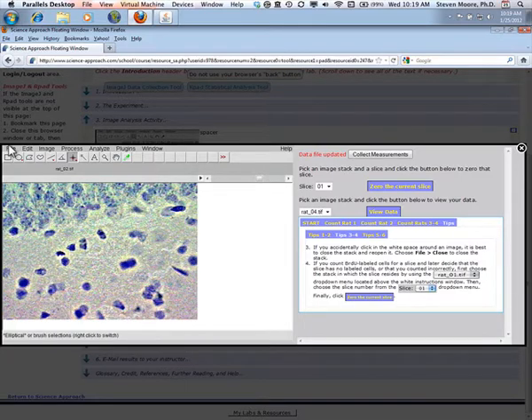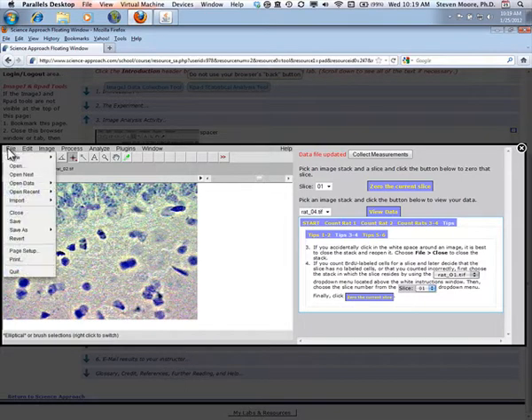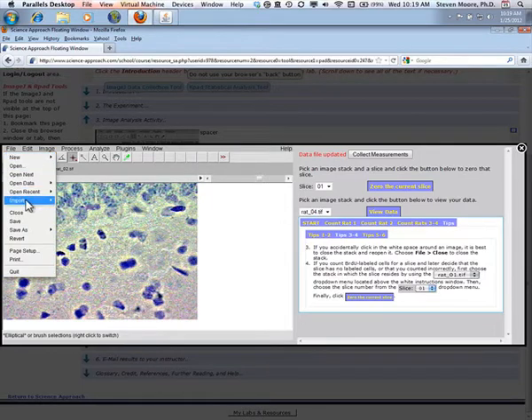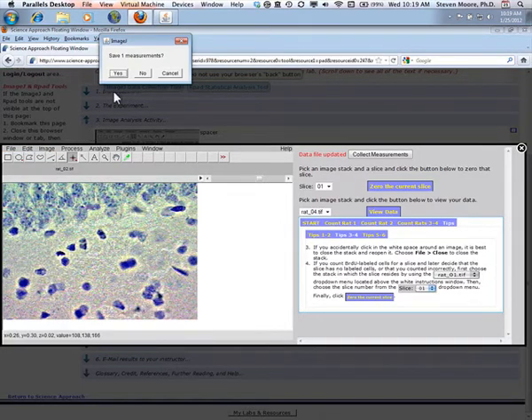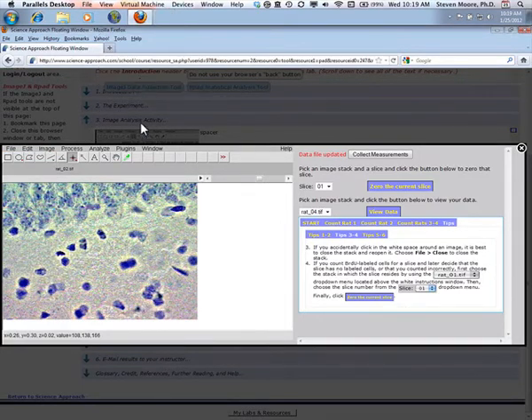When you first choose File Close, a dialog window will ask if you wish to save your measurements. Click No.